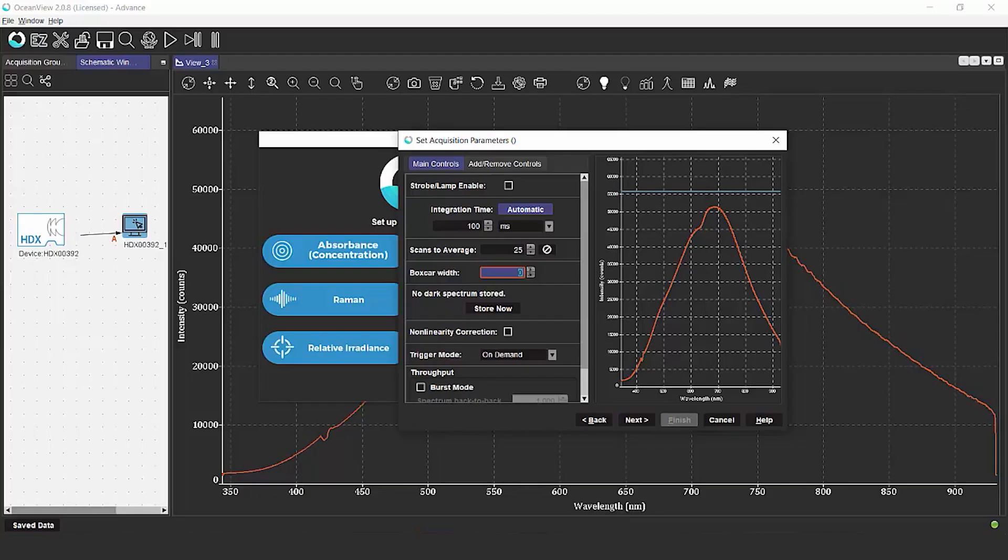So for example, if I pick a boxcar setting of five, which is what I'm going to use for these measurements, that's going to average five pixels on either side. The result is that we get some degradation potentially in our resolution, but it's going to give us a big improvement in our signal-to-noise ratio.